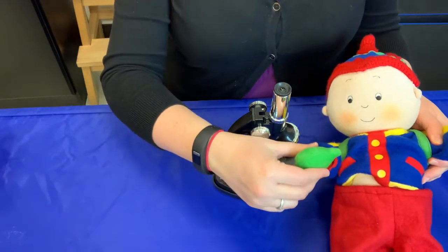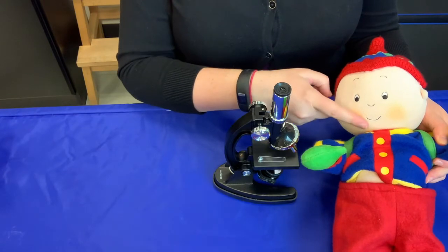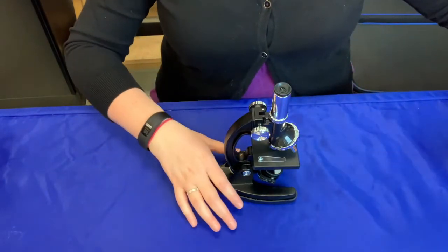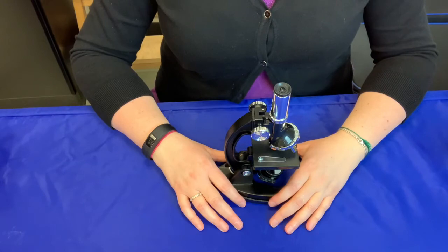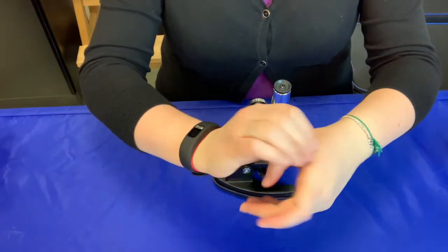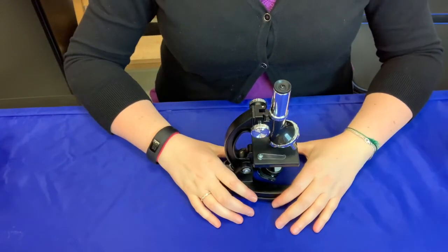Next, when you're working with the samples, keep your hands away from your eyes and your mouth. You don't want to accidentally swallow or rub something into your eye that could be harmful. And always remember to wash your hands very carefully when you're done handling the samples.